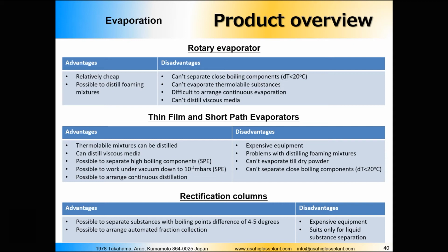As I'm making a demo version of the webinar, I think I can mention them. Well, first of all, we have Buchi with their R220 continuous modification of the 20-liter rotary evaporator, and we also have the Distimatic unit from Heidelberg.